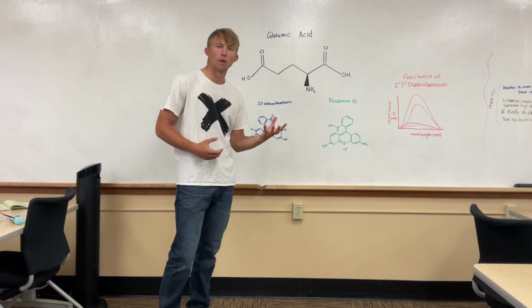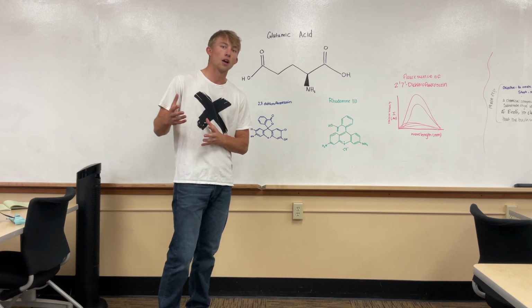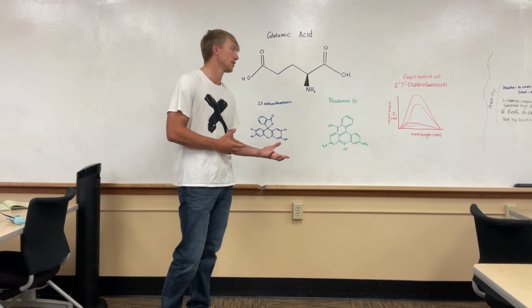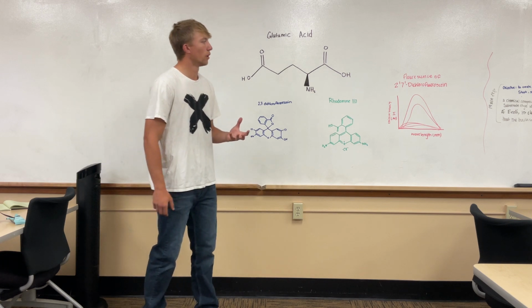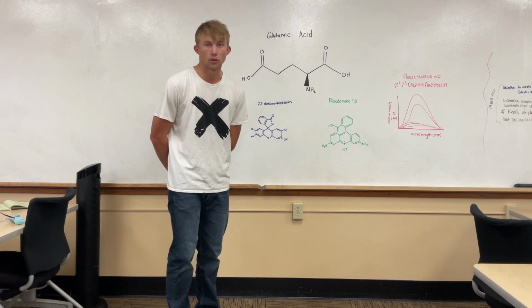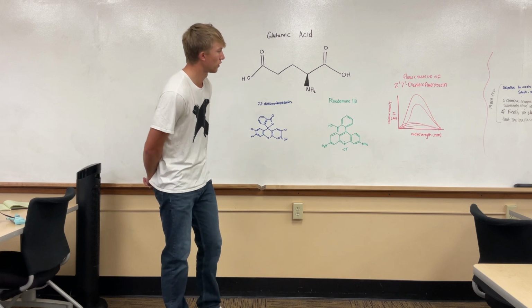They weren't completely soluble in water, so you might have to work backwards from your stock solution to find the correct concentration, because different compounds have different solubility in water. That will give you better fluorescence and absorbance readings when you run the solutions in the fluorometer.